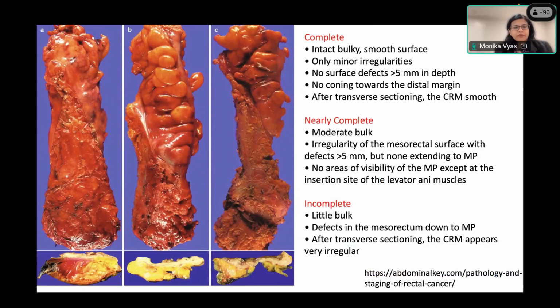So what is evaluation of the mesorectum? In the last decade, the concept of total mesorectal excision, or TME, has come forth. What it means is dissection of the perirectal tissue along the visceral plane. You should see a thin layer of connective tissue investing the rectum. When you see this completely encasing the rectum, there are multiple parameters which you look at. But when you have this thin film or fascia completely encasing the mesorectum, that is most likely a total mesorectal excision.